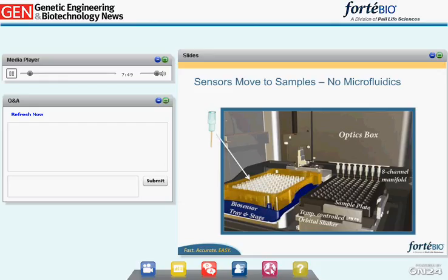Running an assay on Octet systems involves placing a tray of biosensors inside the system along with a microplate containing samples and other reagents. The assay method is created with a few simple operations in Octet software and then allowed to run. The optics box picks up 16 biosensors at once and dips them into 16 wells of the sample plate simultaneously, analyzing two columns of a 96-well plate. Concentration measurement requires just this one binding step.